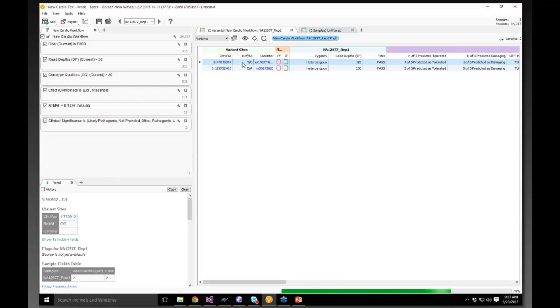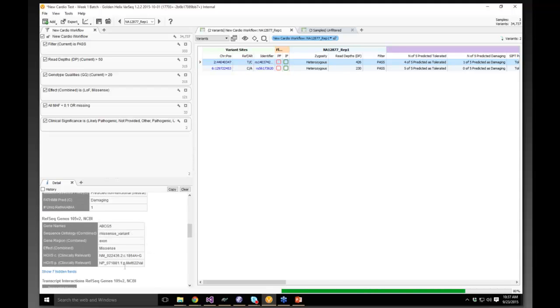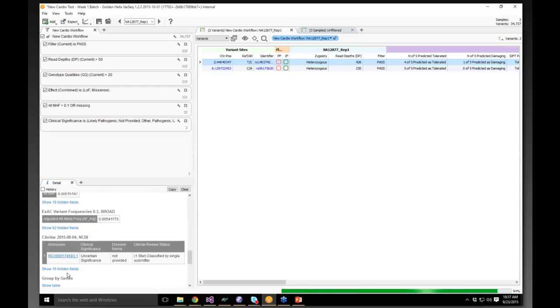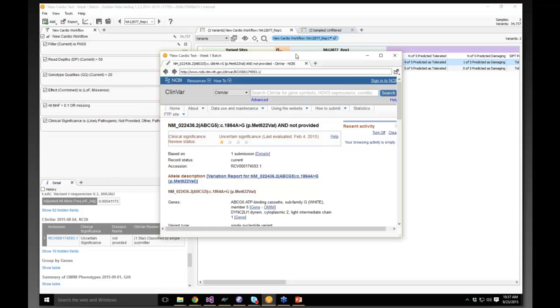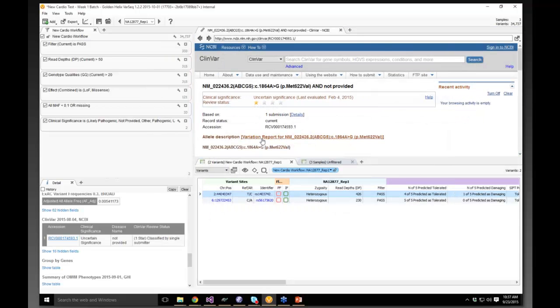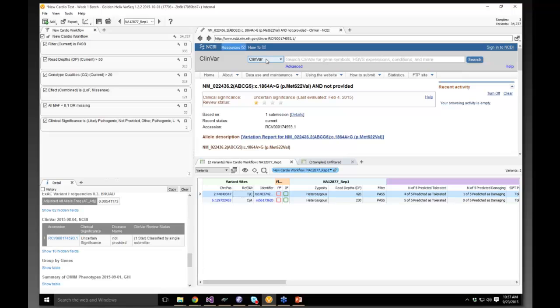So now as I click on a row, I get that rich detailed information down here. I can look at the sequence ontology, HGVS, C dot, and P dot, our annotations for this variant from our different catalogs, and ClinVar's annotation. All these hyperlinks can be opened up into browsers. I can actually dock these browsers into this window. And this same browser can be used for investigating interpretations or the hyperlinks from your table. They will also be used to render and preview those reports.